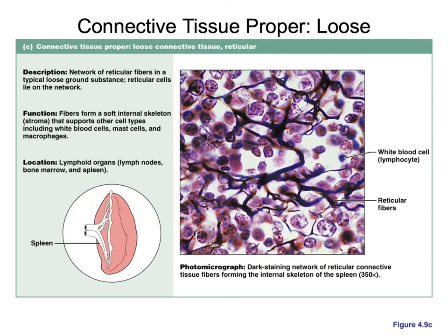The third kind of loose connective tissue proper, with, again, plentiful matrix, is reticular tissue. This view is zoomed in a bit more than usually we see under our microscopes. Occasionally, this tissue is mistaken for blood because of the plentiful cells, but as soon as you see any of these reticular fibers, again, they're not always this thick, but even these thin ones here, that's not blood.